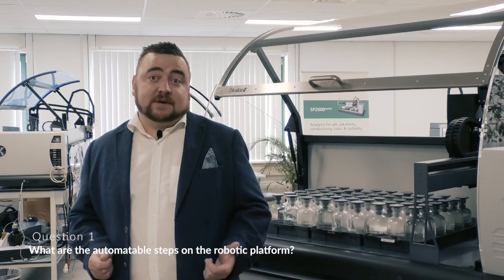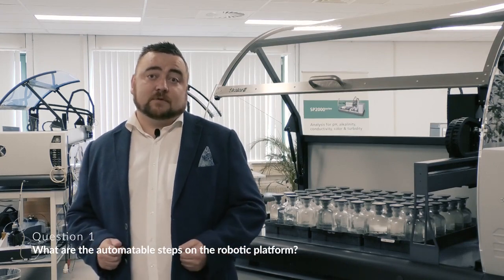We measure the dissolved oxygen concentration of the sample on day 1. The samples are then incubated for 5 days, and then a final dissolved oxygen measurement is made and the BOD is calculated accordingly. So, question 1, what are the automatable steps on the robotic platform?